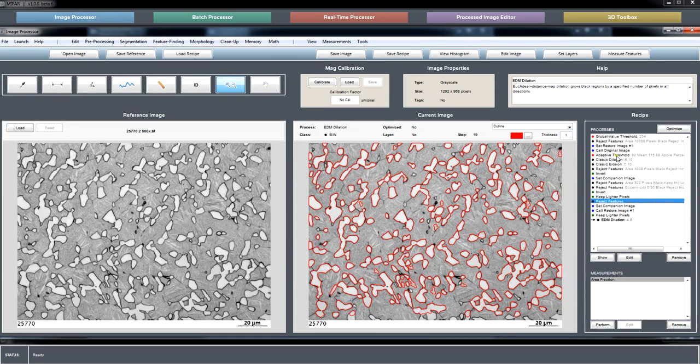And once you have these recipes built, feel free to put them in a library, send them around to folks at your place of work or company that use them, and the hard part is really done once the recipes are made. Again, we are working hard to get that recipe store up and running, which I think will be an incredible resource for many folks.